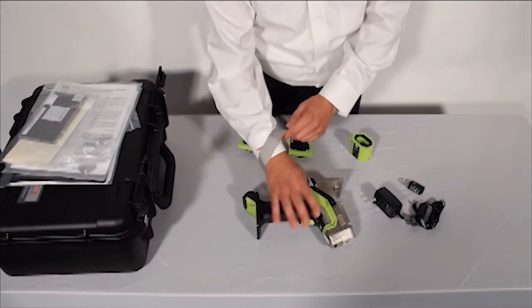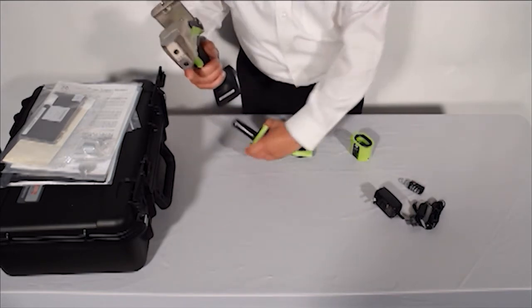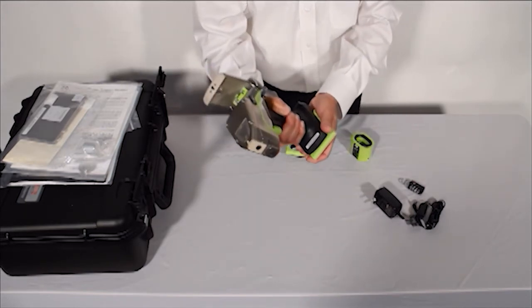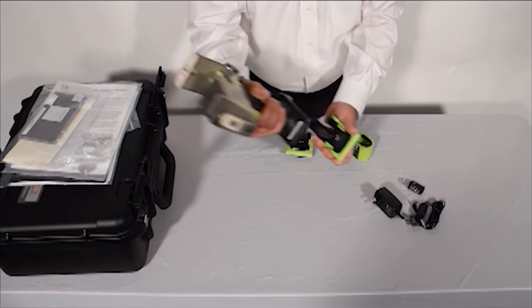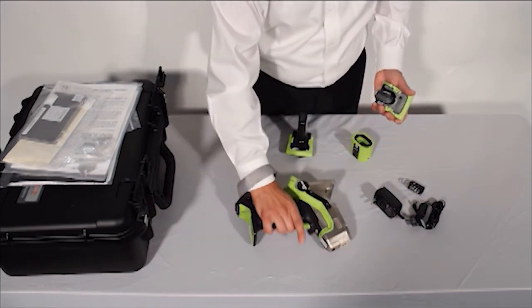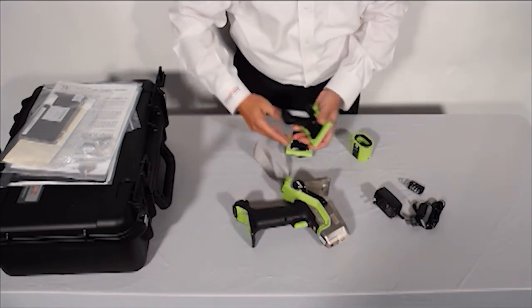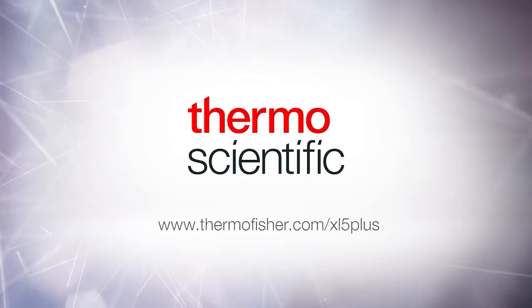To install the battery, put the lanyard on for safety. Insert the battery in the bottom of the analyzer. To remove it, squeeze the two tabs and pull it out. It's that simple. Enjoy your new Niton.